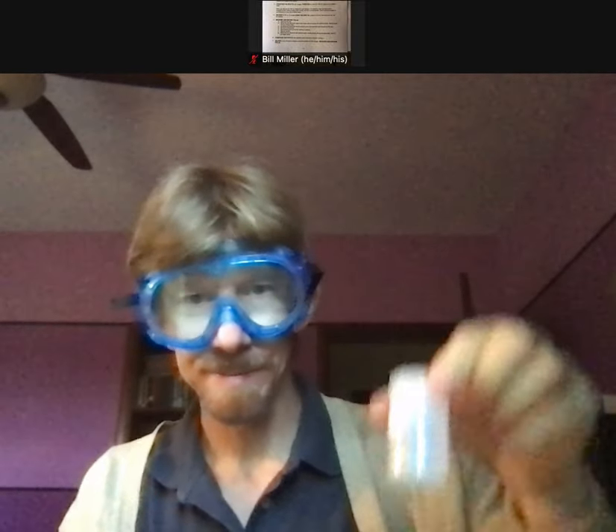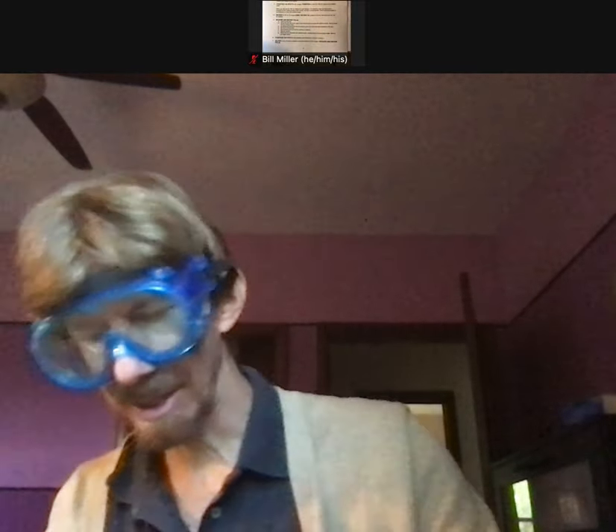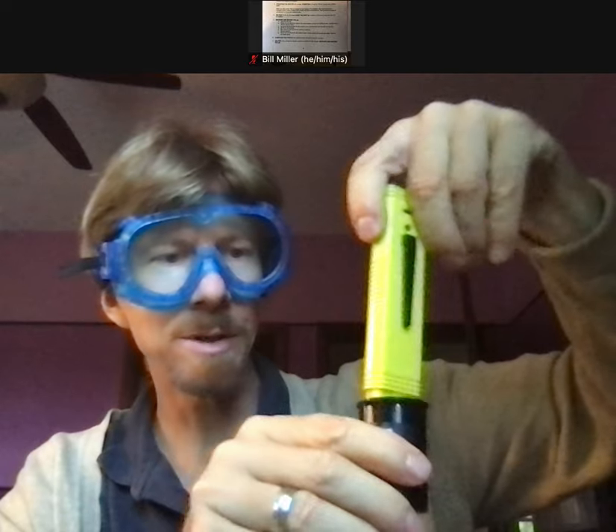Now I rinse the pH electrode with distilled water. I'm going to cap my pH 7 buffer and get my pH 4 buffer and uncap it. I'll repeat the steps with the pH 4 buffer, so now I'm placing the electrode in the pH 4 buffer for 5 to 10 seconds.